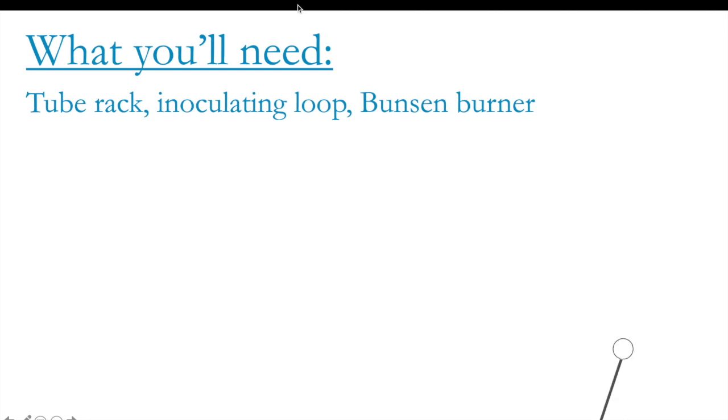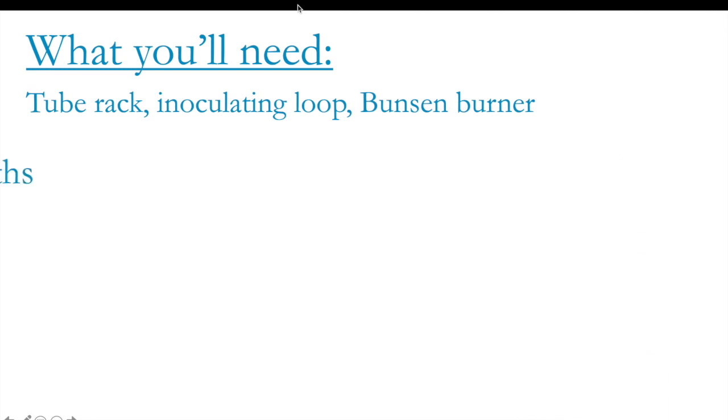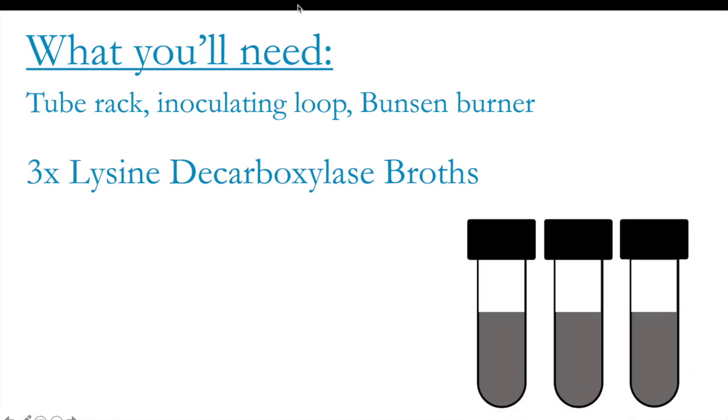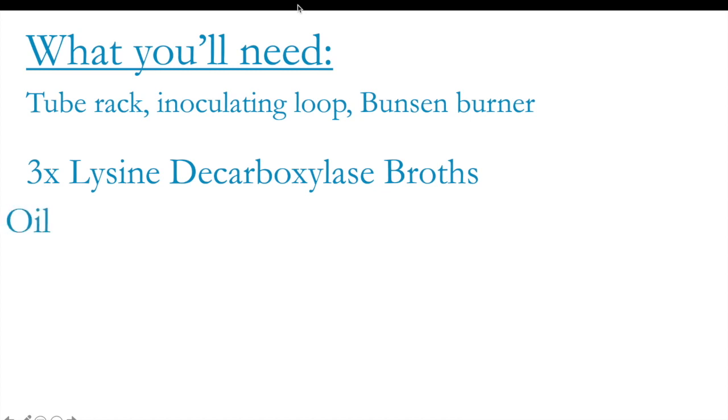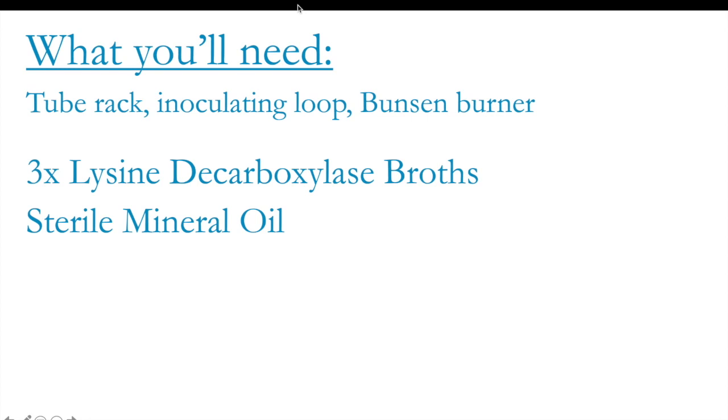So what you'll need: you'll need to grab a tube rack alongside an inoculating loop and a Bunsen burner, of course. Once you have that, you will then need to grab 3 lysine decarboxylase broths. After that, you'll need some sterile mineral oil, and finally, you will need some sterile transfer pipettes in order to transfer the mineral oil into your decarboxylase broths.